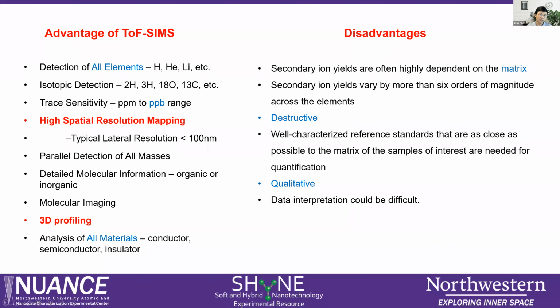Secondly, destructive. After this, because they get fragment come out after this sputtering, even that is a short time, your surface will be damaged. Some surface layer will be damaged. And then, so if you want to do quantification, you need a reference sample, the standard sample, have same matrix, you know and the concentration.